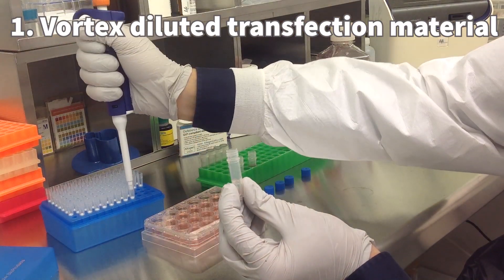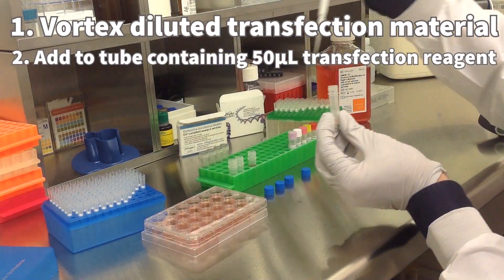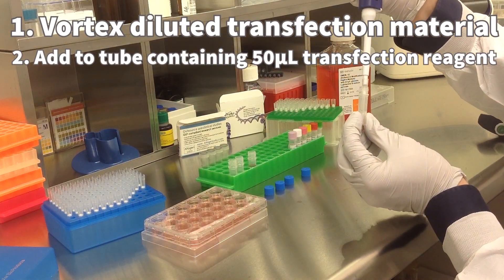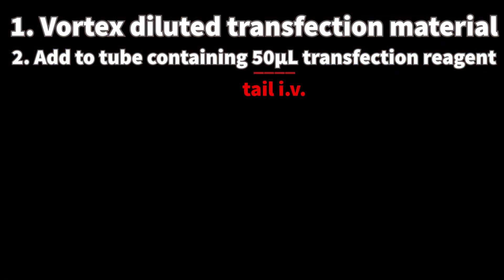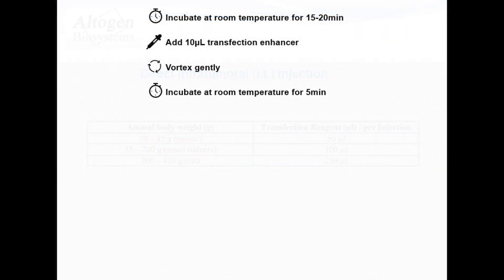Make sure to vortex the diluted transfection material before adding to a sterile tube with transfection reagent. For tail vein IV, use 50 microliters of transfection reagent, and for intratumoral administration use the chart to determine the optimal volume. Next, incubate the mixture for 15 to 20 minutes at room temperature to allow complex formation.